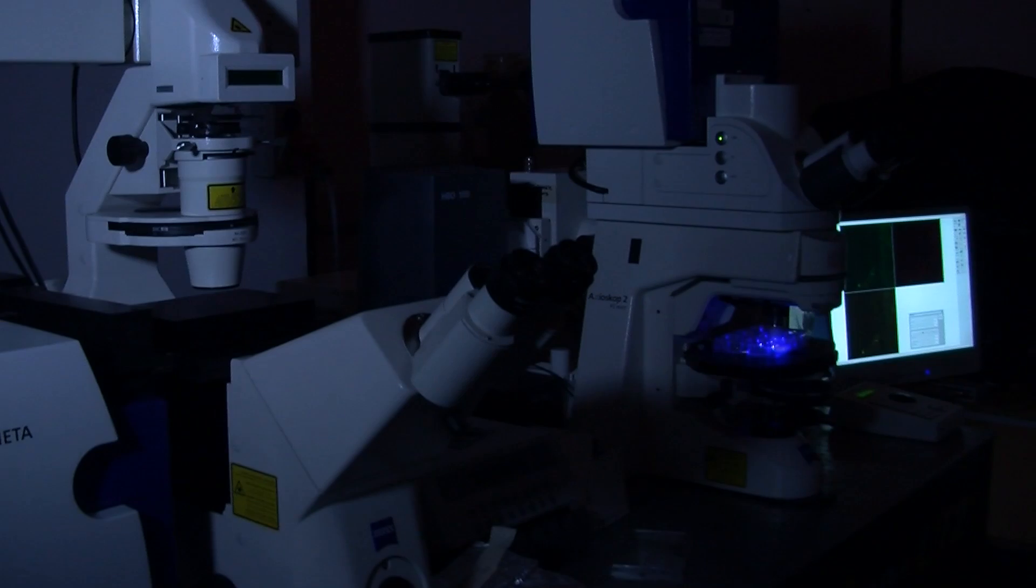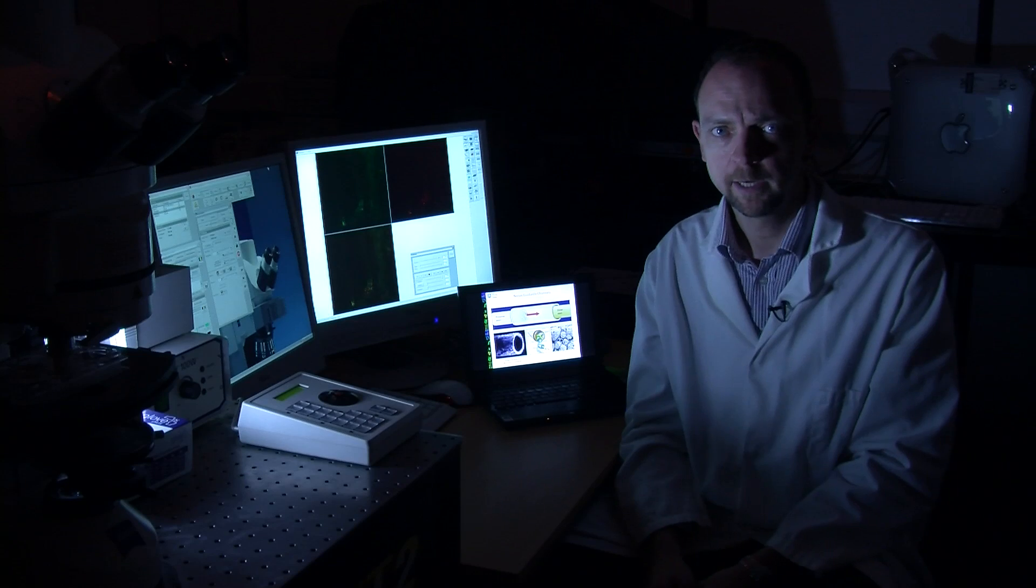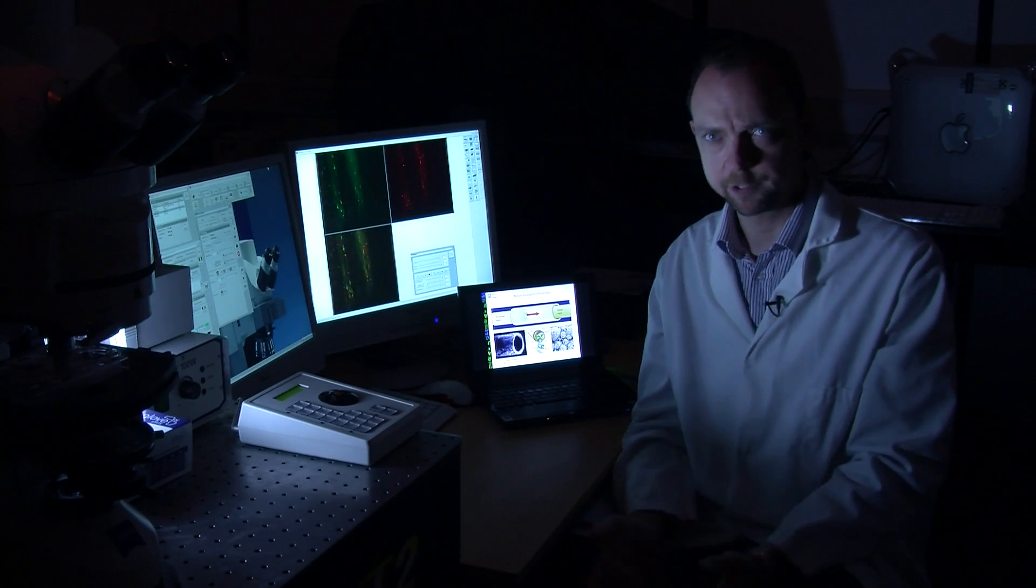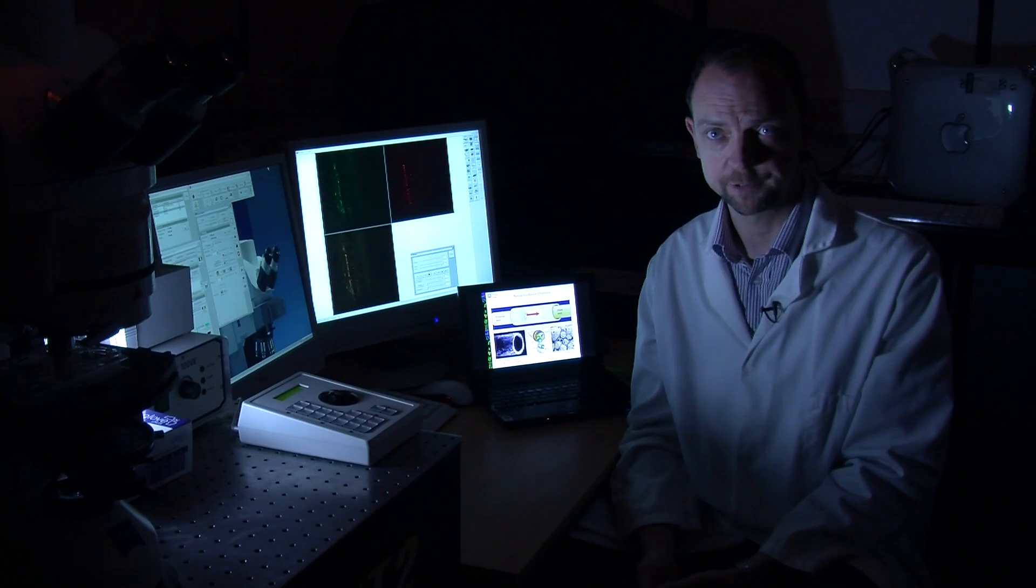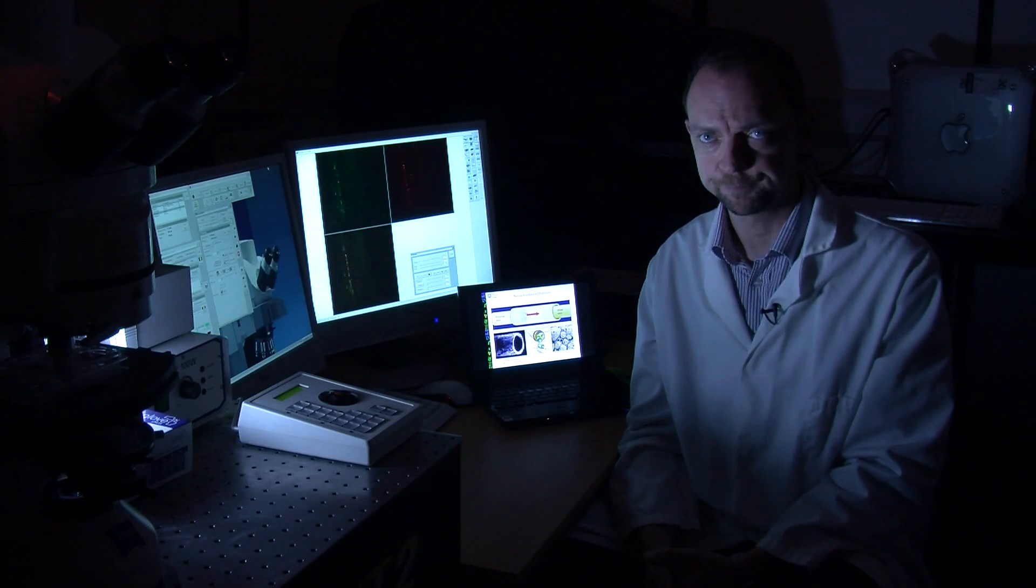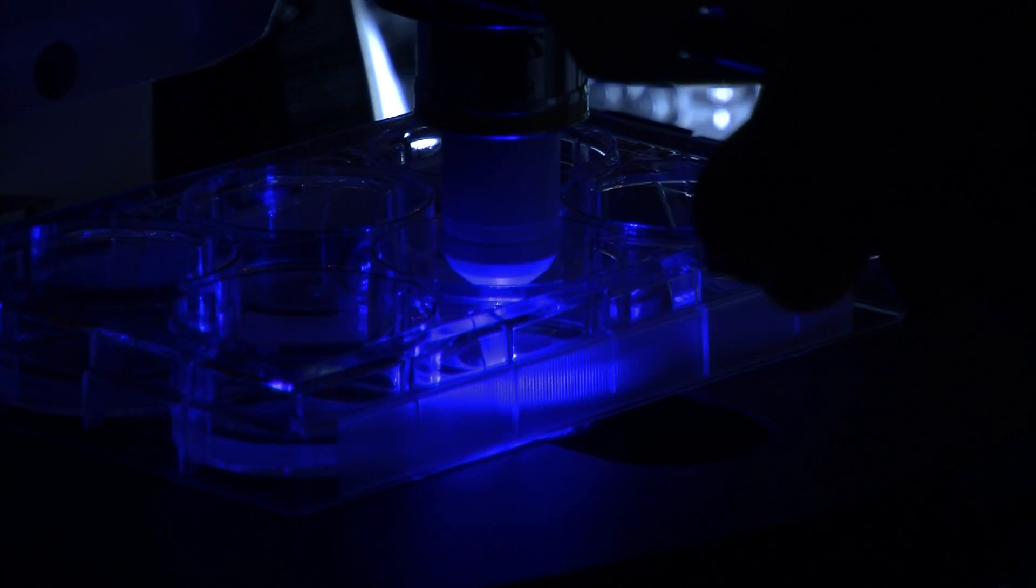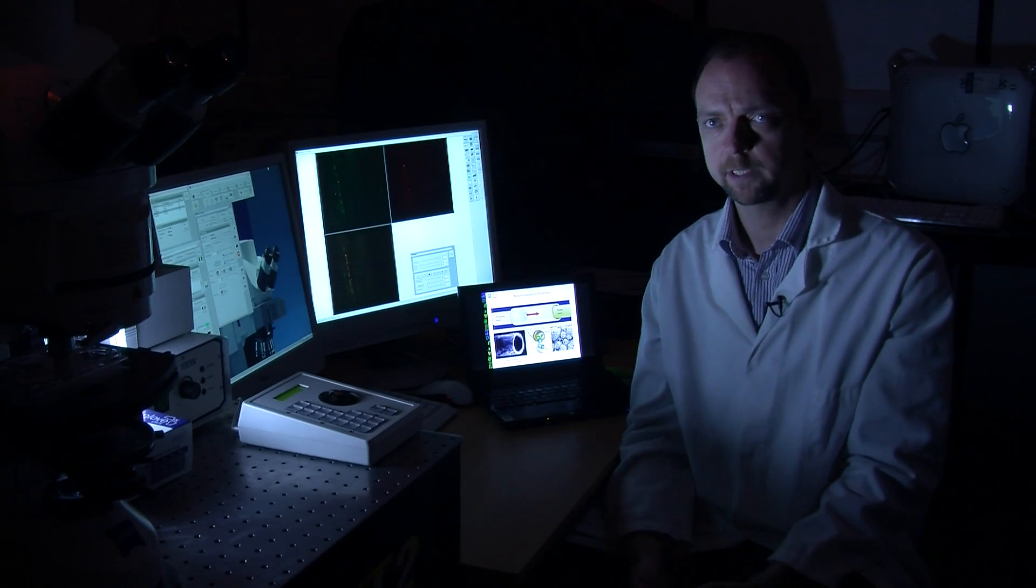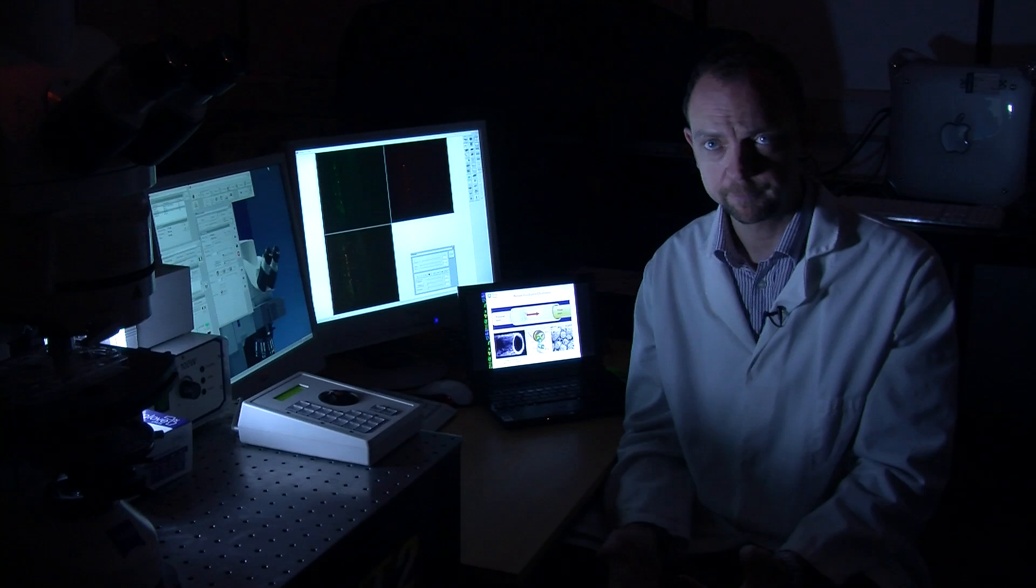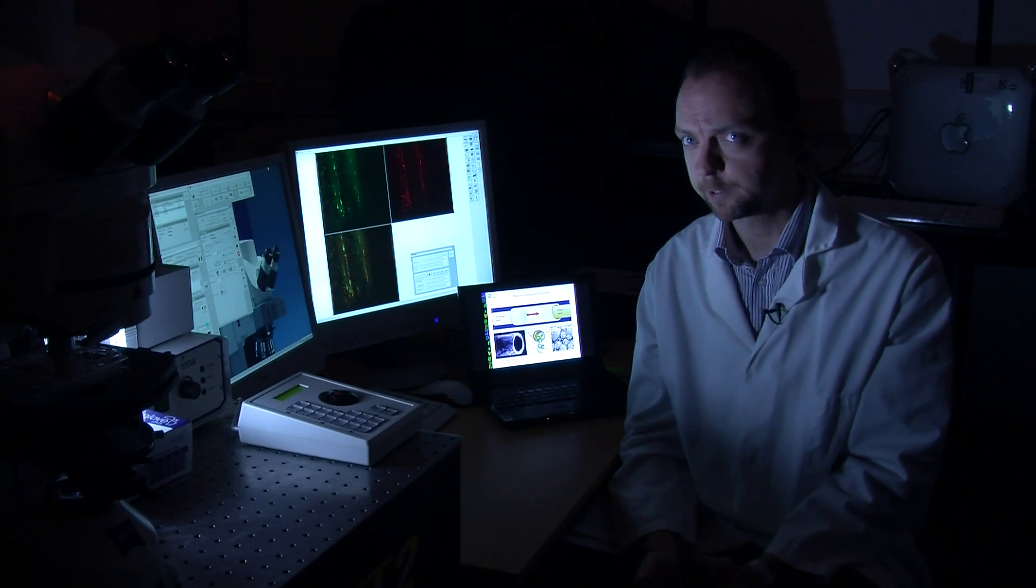This is our confocal microscope imaging facility - we have two confocal microscopes here powered by these computers and a set of lasers. We're imaging tissue constructs and cell and biomaterial constructs in three dimensions. We put the sample on the microscope here, and the sample contains a synthetic fiber scaffold, and seeded into that synthetic fiber scaffold are nerve cells. We let them grow for a few days and then we need to image them in three dimensions.